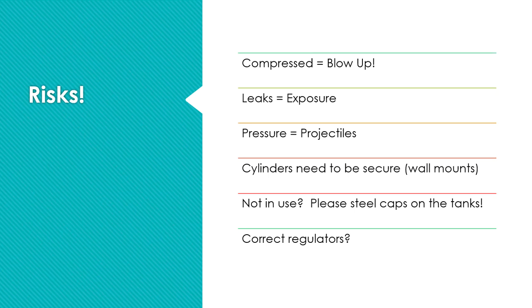When we work around gases, we're working around temperatures, we're working around pressures. So there are a few things that we want to watch out for. Number one, they are compressed. So boom, it goes. We don't want that to happen. So I want to make sure that I'm checking the regulators, and the pressures on these gas tanks and the gas supply lines and where they are getting delivered. Because if the pressure builds up too much, then these things can go boom, and I don't want that to happen. My coworkers don't want me to do that either.